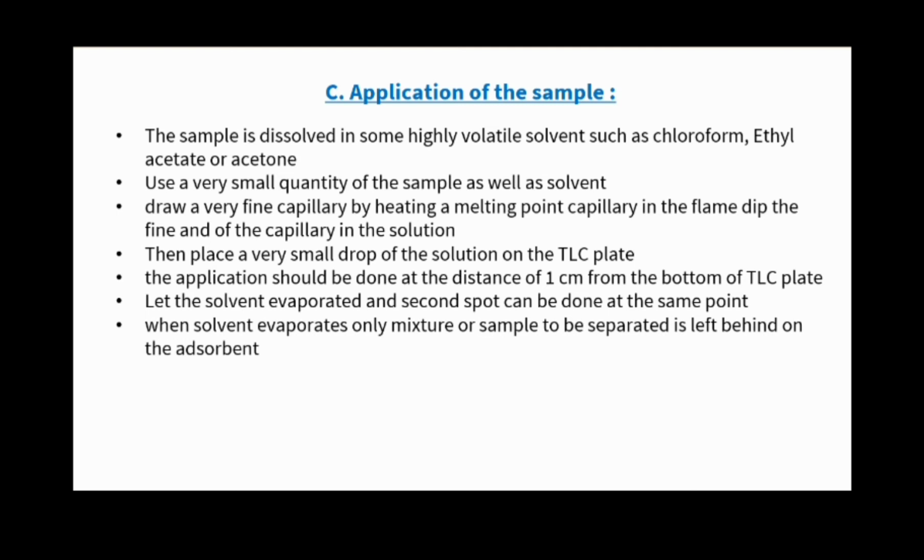When solvent evaporates, only the mixture or sample to be separated is left behind on the adsorbent. It means when we spot our TLC plate, it must be done at a distance of 1 centimeter above the bottom of the TLC plate, and when we apply one spot we have to wait a few seconds until the solvent evaporates.